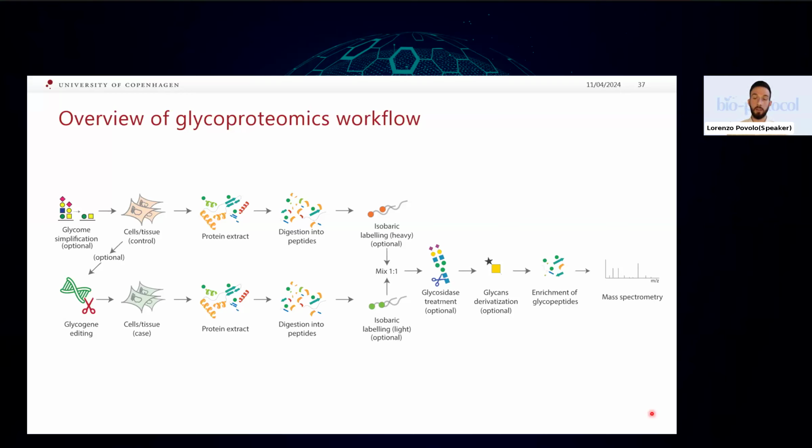Other endoglycosidases can be used. For example, Endo H can have partially non-overlapping activity with PNGase F. I would also recommend going back to the references on glycosidases for this. But unless I'm missing some biology in this specific protein, in theory it should be possible.